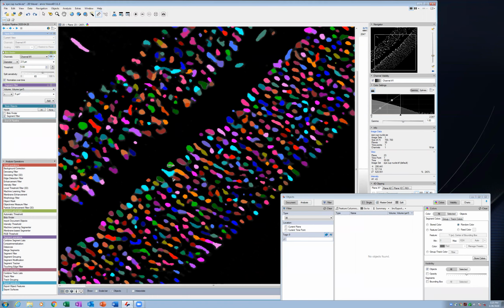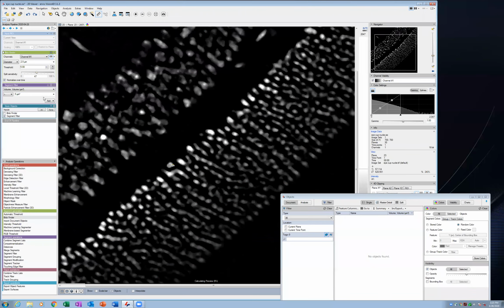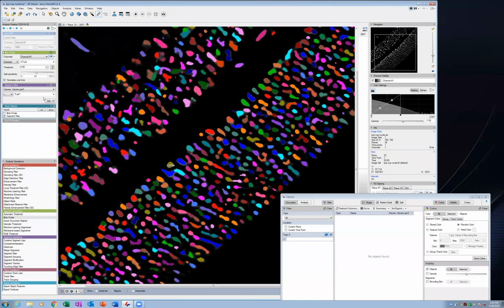That is kind of like a watershed function. So it tries to decide, if there's one object with continuous intensity across it, but it sees two peaks within that object, it's going to split those. So it looks like here we have a bunch of things that probably should have been a single object that have been split. I'm just going to reduce that a little bit as well.